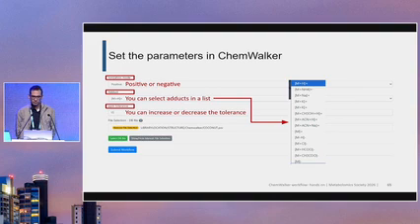Then of course you're going to look at the type of instrument. Usually for the Q-TOFs, you need to set a higher threshold. For the Orbitraps, you can set it lower because of the sensitivity of the instrument. It's also going to depend, as you already mentioned, on the protocol you used for the extraction. For example, you're probably going to see more of certain kinds of drugs than others.